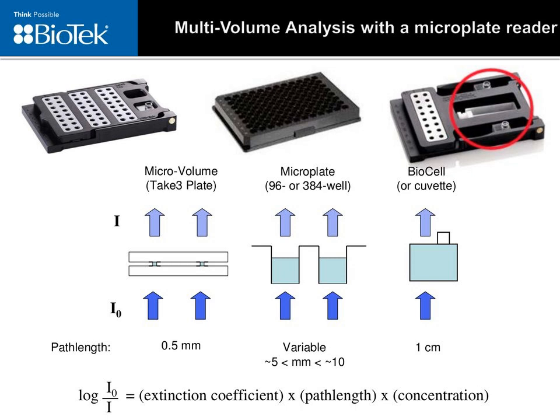So I believe Life Technologies has some specific dyes that can be used. I don't have that information at hand, but I would certainly contact those folks. We've worked with several of their dyes, and I think that they provide a nice array of dyes. So that would be my recommendation.